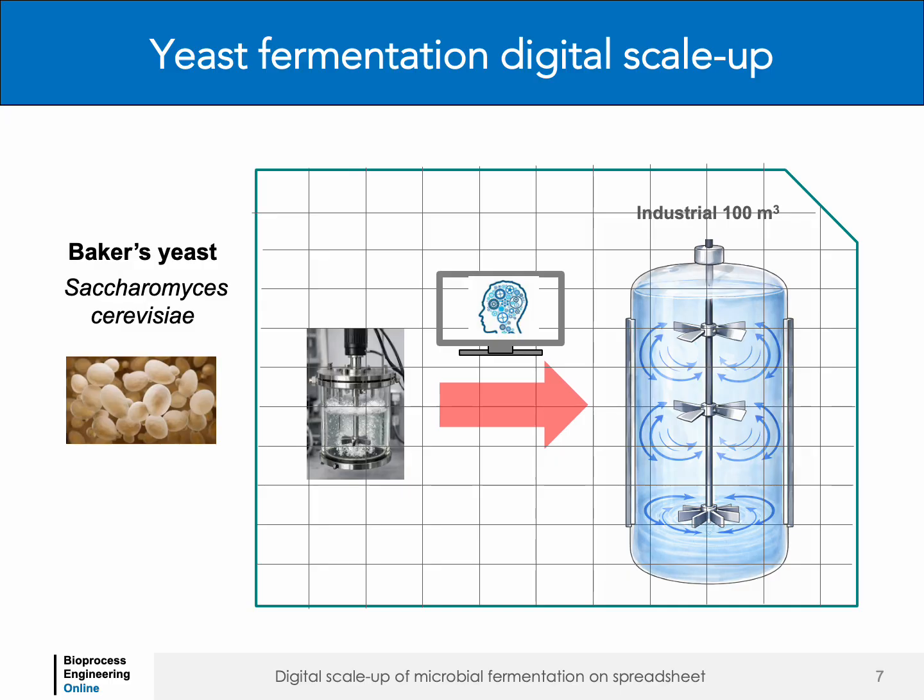In this tutorial, the digital scale-up methodology is illustrated through a case study on the fermentation of baker's yeast, Saccharomyces cerevisiae, progressing from laboratory scale to an industrial 100 cubic meter fermenter.